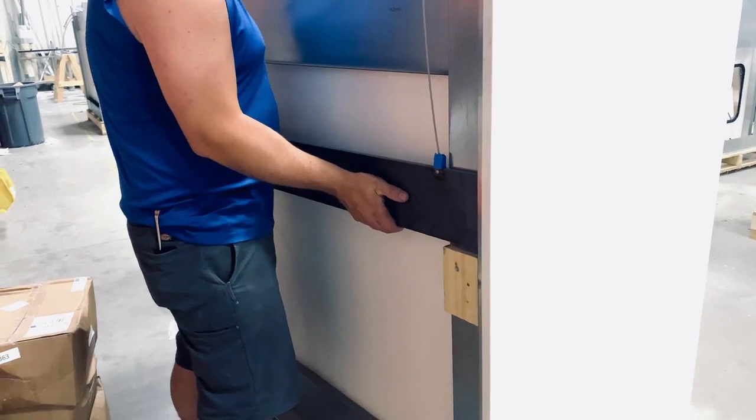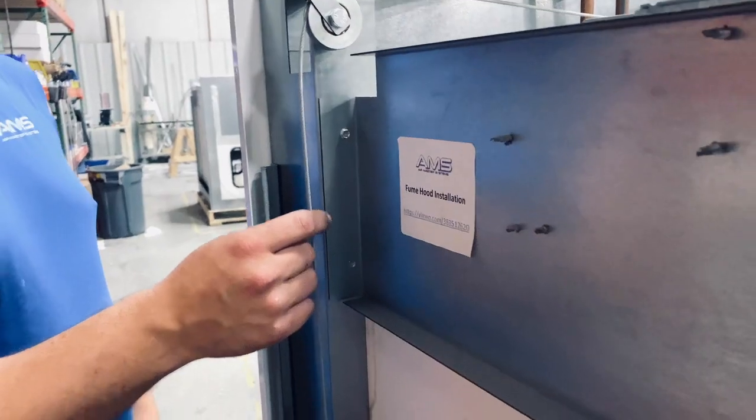The next step will be to make sure you block off the counterweight and make sure it is securely supported. There must be slack in the chain or the cable.